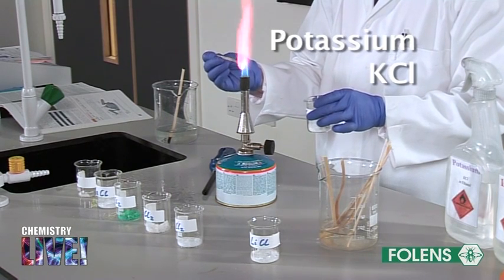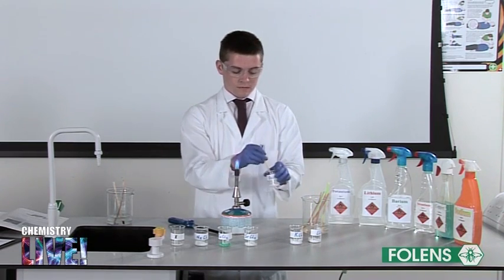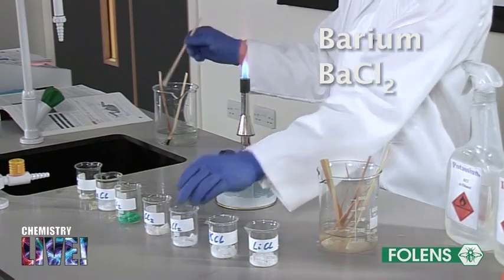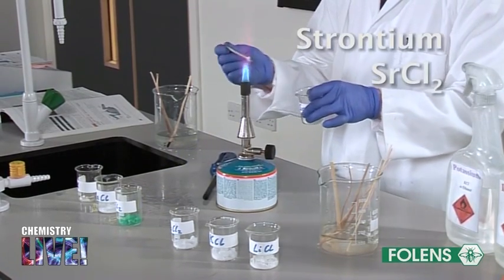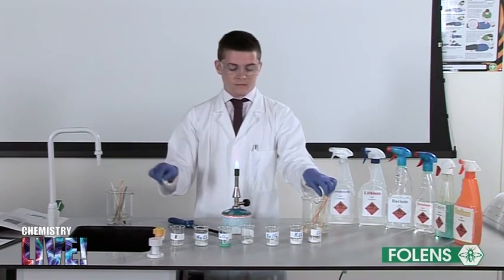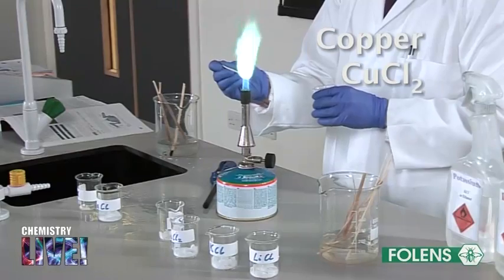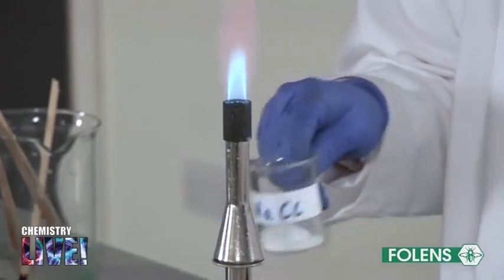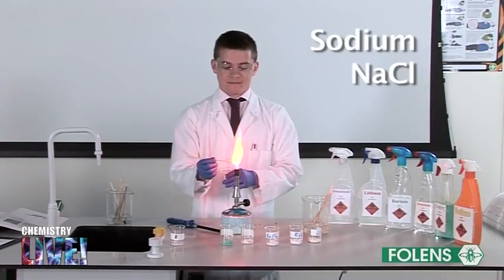Potassium gives a lilac color. Barium gives a green color. Strontium gives a red color. Copper gives a blue-green color. Sodium gives a yellow color.